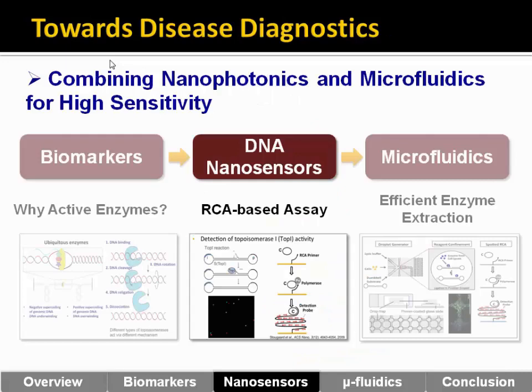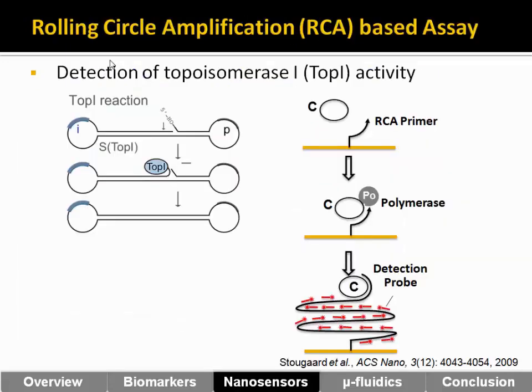So how are we going to quantify the enzymatic activity? This assay was initially developed by my collaborator, Dr. Birgitta Knudsen's group at Aarhus University. Shown here is a sensor that we designed for topoisomerase 1 activity, but the principle can be applied to other enzymatic activity as well.